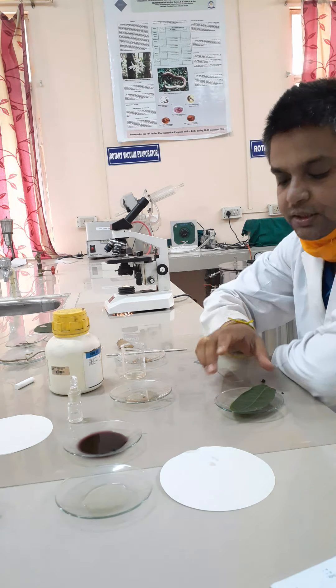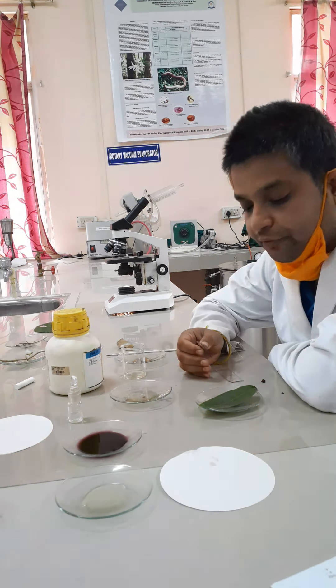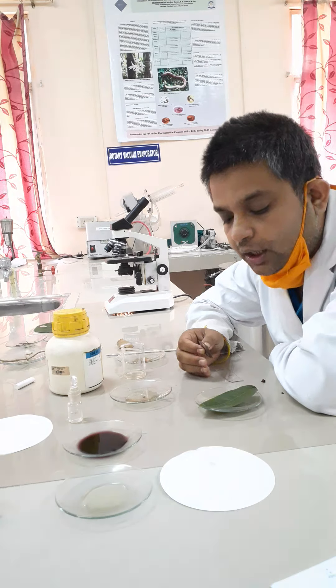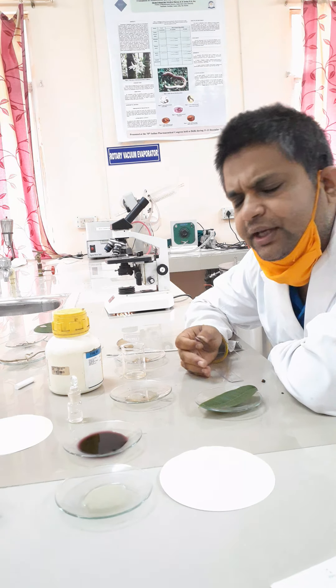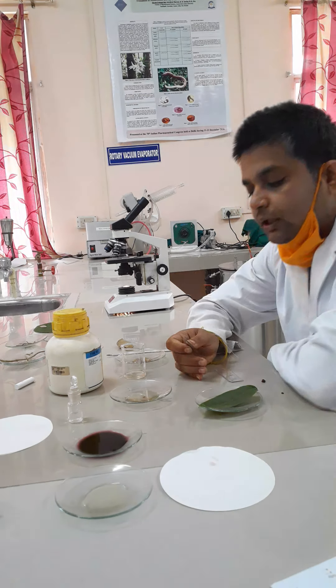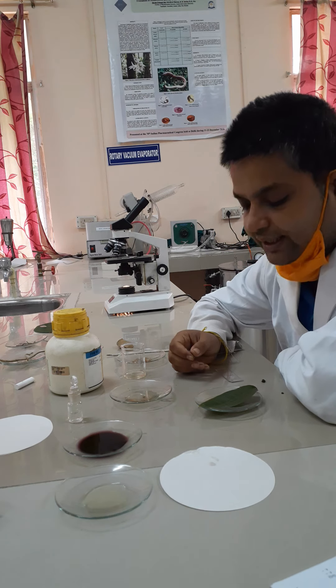In today's experiment, we are going to show the transverse section of a leaf — how to take a transverse section of any leaf. It may be a datura, it may be a senna, or it may be any type of leaf. The technique we are using here is known as the sandwiching technique.